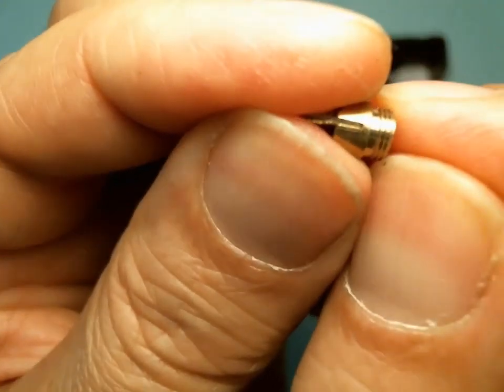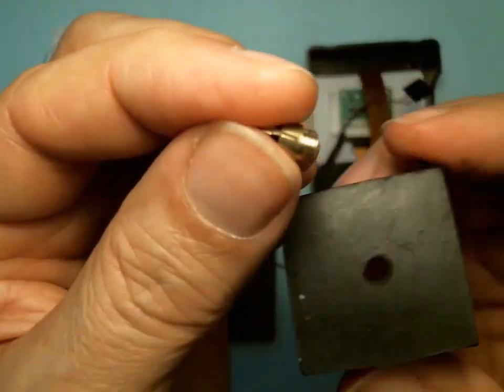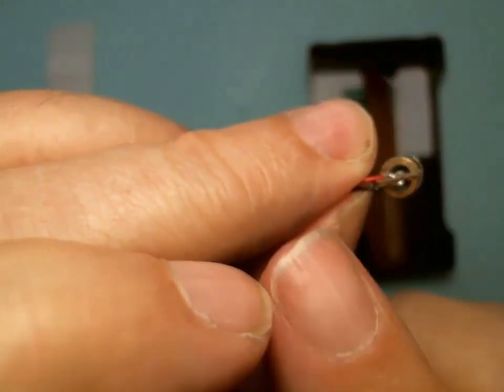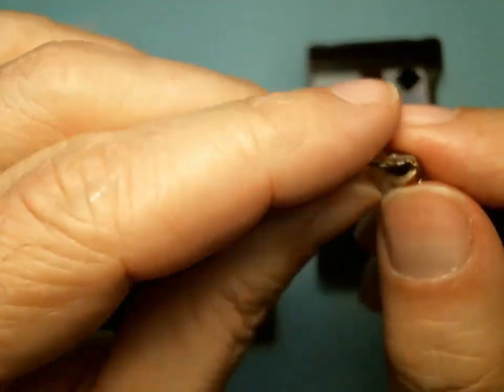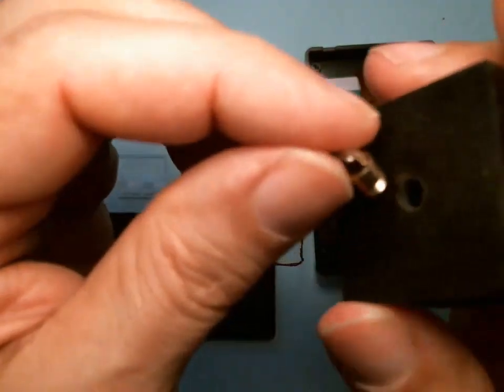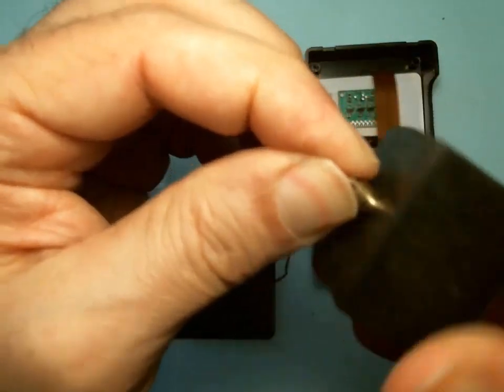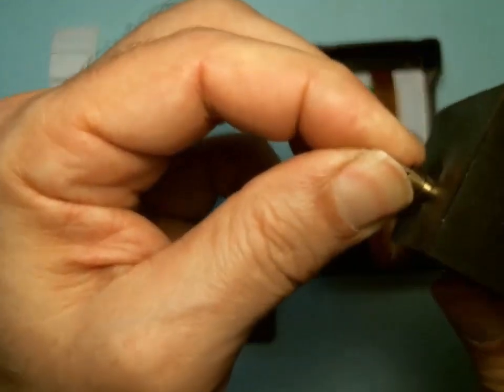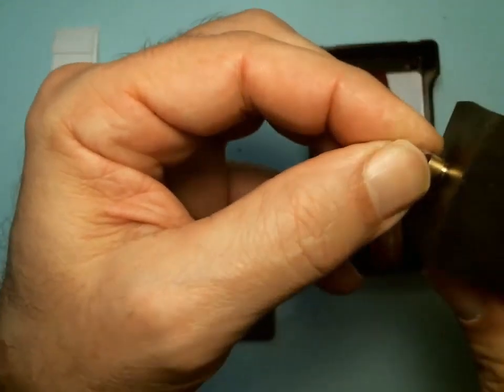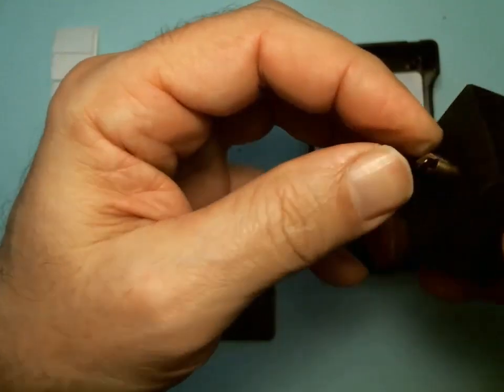You notice it has threads on it. That'll help us. And so here's the cap. And also notice the alignment, this circuit board alignment. Notice it's like a line. That's going to be important. So the hole is slightly smaller than this diameter, so you have to push it while you twist it. Okay, it's rubber, so it'll give a little. So push and twist. What you're doing is kind of making threads. And the reason I made it a tight fit is you want it vertical.